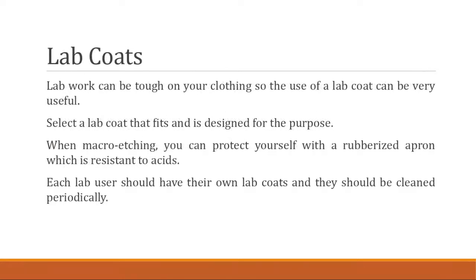Lab coats. If you love your clothes, you'll wear lab coats. They are useful for protecting your clothing.